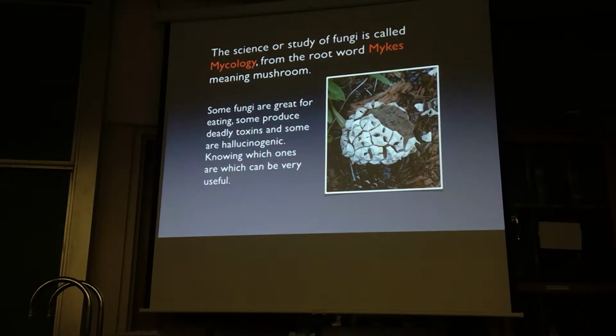This is a pretty good size type of fungus. In the Riker mounts that are up here, these things are also puffballs with very long stems. And then you can see the spores coming out of these guys. Something like this would be supported by a lot of filaments that are way down in the soil. So these things were coming up out of sand, but the vegetative mycelium would have been down where there was some moisture. This kind of structure, the reproductive body, would also be supported by a vegetative mycelium that's down in the soil.